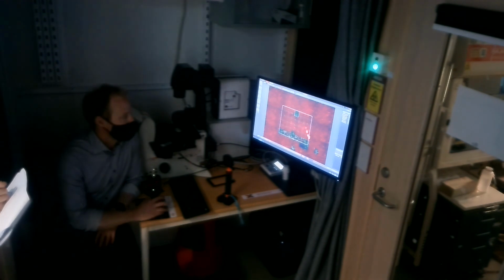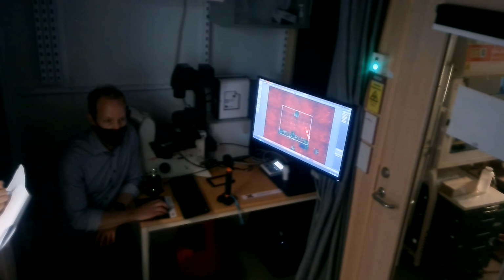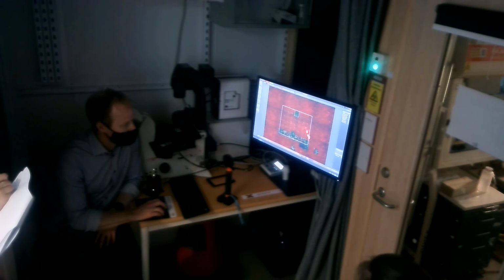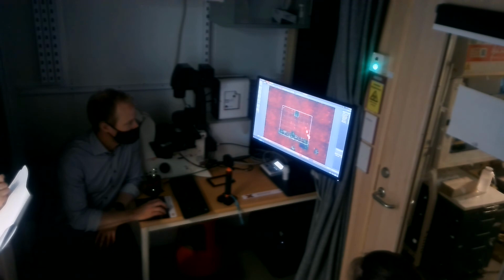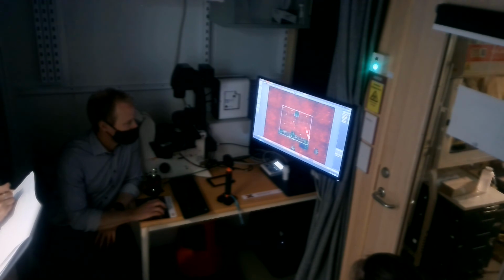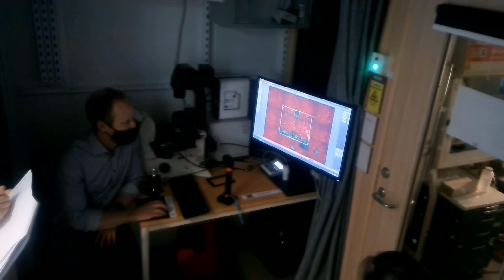So there's another way to choose where to do it. We could do it in the first only, or every second, third or so, but we can also use this tool. It's right next to the focus map tool: the green autofocus point. If I activate that, I can tell it exactly where I want to do an autofocus job. So now I can pick places where I see that it looks good, here I can do it.